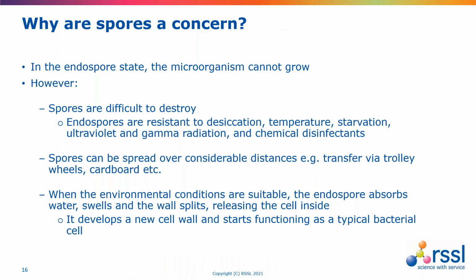So why are spores a concern? Well, in the endospore state, bacteria cannot grow, but because the whole rationale for forming the spore is to survive adverse conditions, under conditions where most other organisms might be destroyed, bacterial spores might be present. And they're sitting there ticking away until conditions become favourable, and then germination is possible. And the primary mechanism is having sufficient water available.